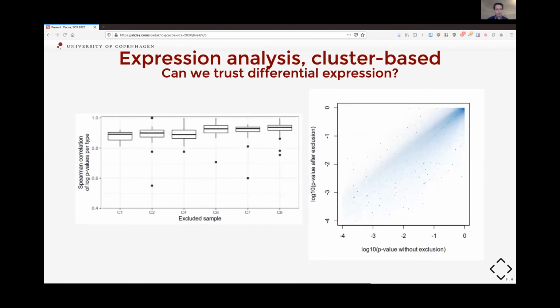Next, I want to make a remark on gene expression analysis for case control studies in general, because that's one thing which is really important to keep in mind, and which I never saw in any publication, but we discovered in our analysis. So the point was that we had like 14 samples, and we got revisions from the paper, and we wanted to investigate them further. So we wanted more data. We got 2 additional control samples, and we added them, repeated exactly the same analysis, and we got really different sets of genes.